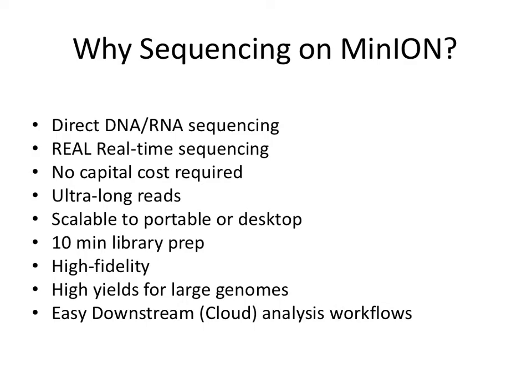They've got rapid prep, and I've got a slide showing that if you use the transposon, the library prep can be quite short, really a few minutes. We've done it. What they said is hands-on time, and that's how long it takes. High fidelity is something you use with enzymes. It means that you can slow down the pore enough to really tell between one base and another. This is a word you use with polymerase, but it's the same idea.